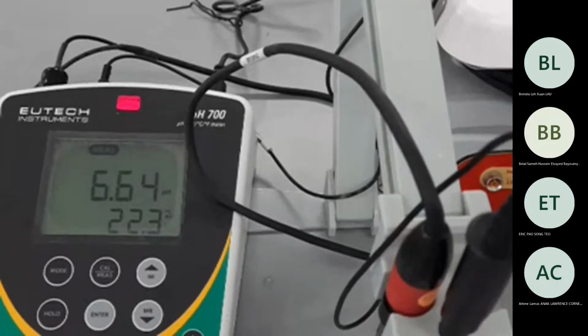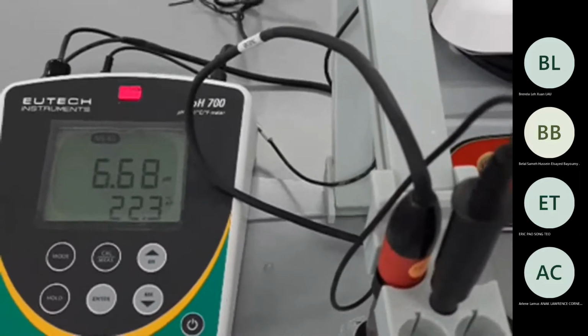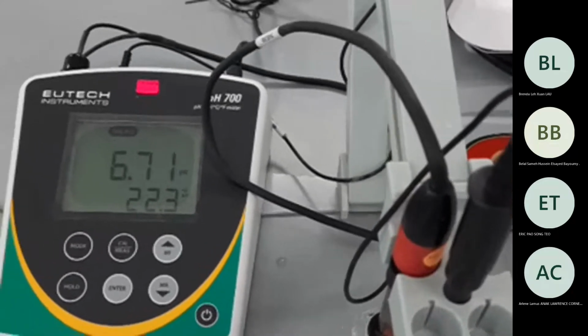So the tap water is almost towards 7, 6.64 now. It's not ready yet. It's increasing, and I think it will be around 6.8, 6.9, or maybe 7.